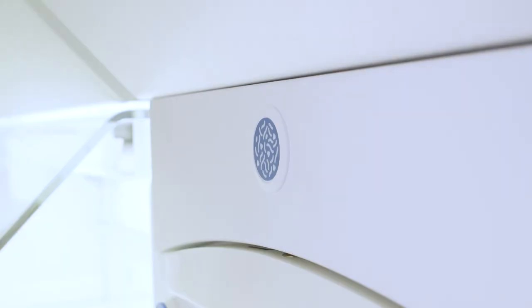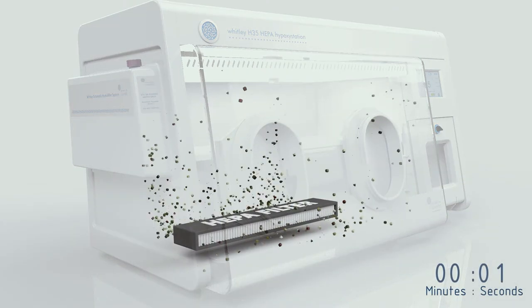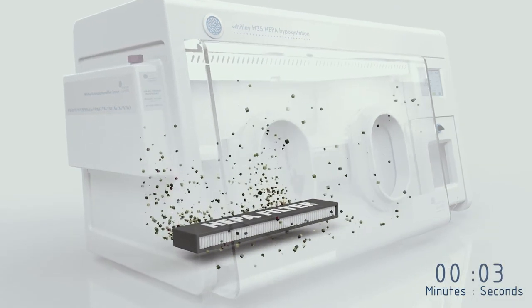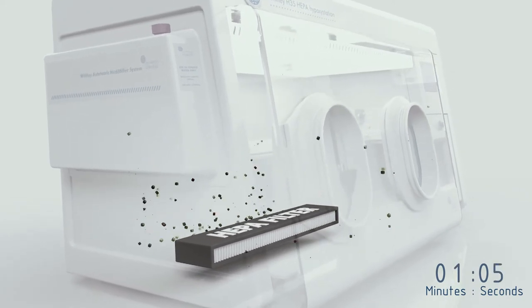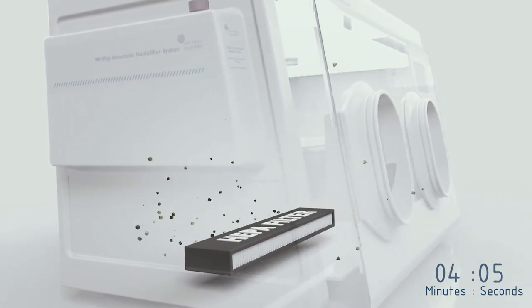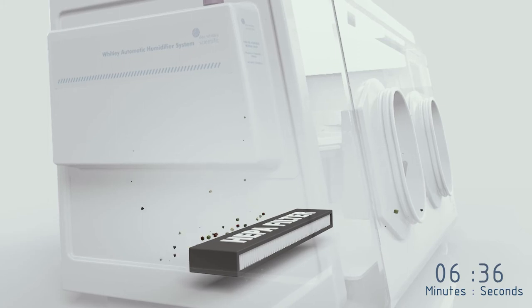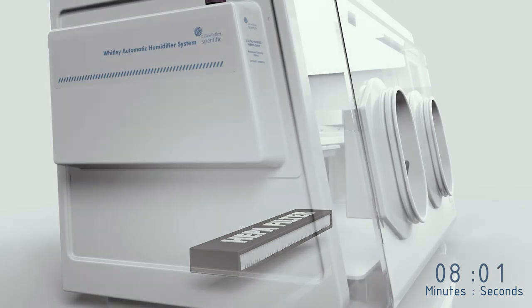HEPA filtration reduces the particle counts inside the chamber to levels exceeding the requirements of ISO 14644 class 3. The entire hypoxic station atmosphere passes through the filter hundreds of times an hour, which ensures the chamber environment is cleaned quickly. The filter location inside the hypoxic station prevents it becoming saturated with moisture.